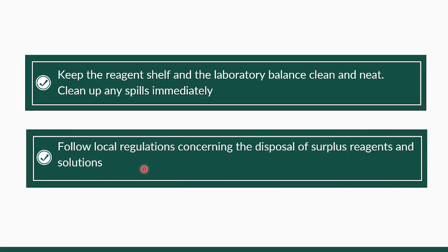Then, last one, we need to follow local regulations concerning the disposal of surplus reagents and solutions. So, we need to ask our laboratory technicians asa na pwede ipanglabay ang mga nagamit na nato na chemicals during carrying out our laboratory works. So, na-mix na nato, asa man nato na siya ilabay?